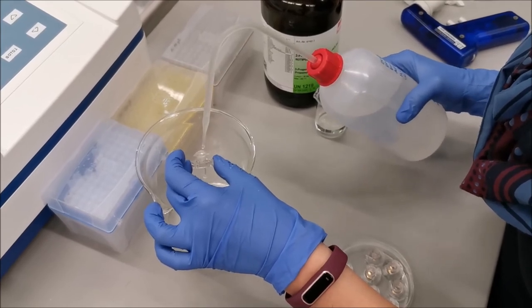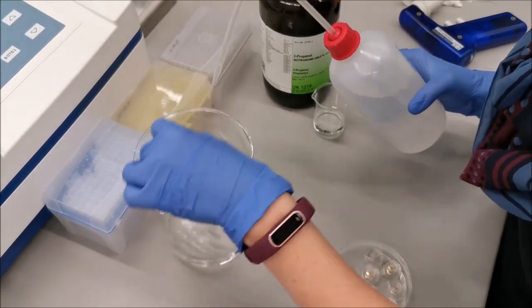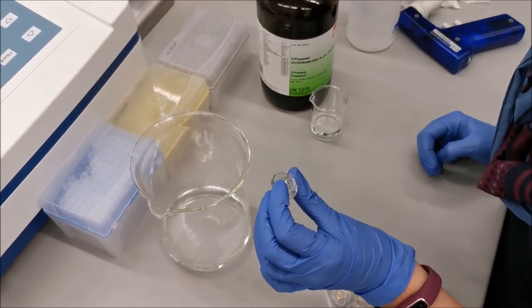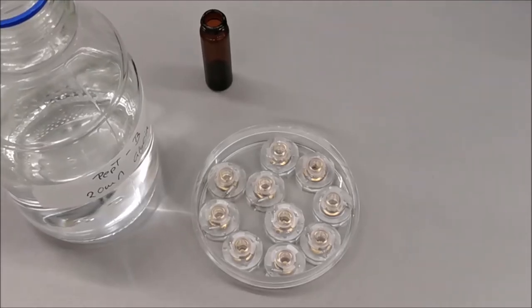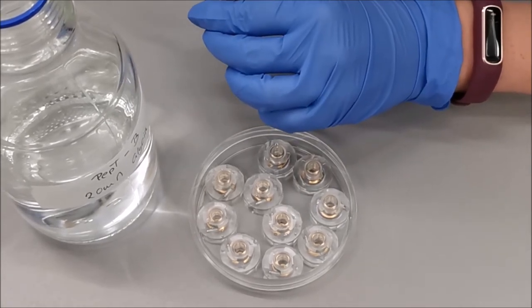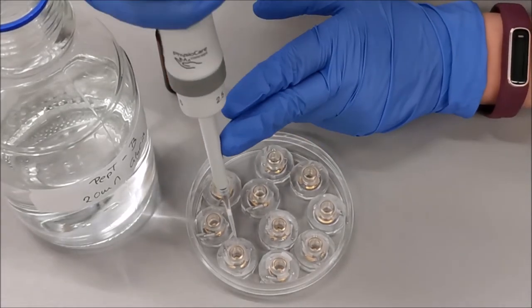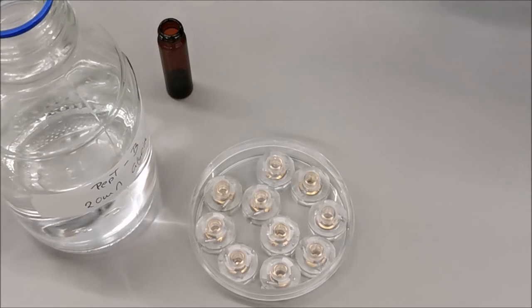It's important to get the sensor surface completely dry here. The thiol layer is very hydrophobic. That's why there are no water droplets remaining after shaking off the water. After this step, the sensor surface looks very shiny. Now we add 1.5 microliter of the lipid solution to form the solid supported membrane. We carefully form a drop on the pipette tip and place it on the gold area of the sensor.